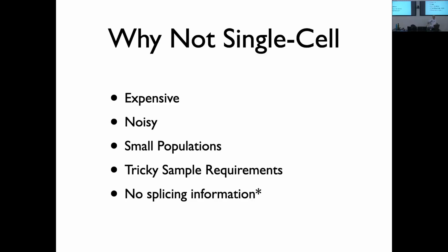So you end up seeing a lot of what's called dropout in single-cell RNA-seq, where for a given cell, you might not see any expression for a gene. And of course, of the 20,000 genes in the genome, you definitely don't express all of them. If your sample is a blood sample, you don't expect to see expression of neuron-specific genes. But again, you also don't see expression of T cell specific genes in some of the T cells. And disentangling that biological noise from the technical noise, there are approaches for doing that, but it's not great.